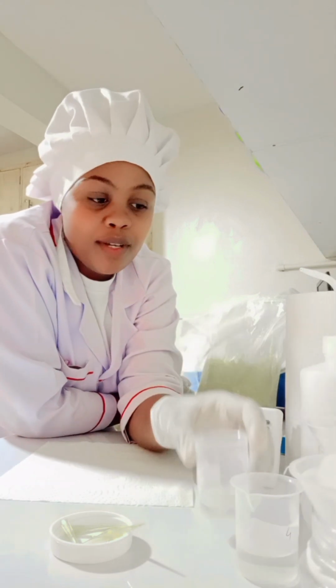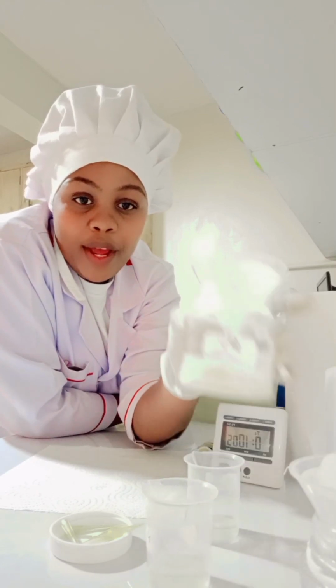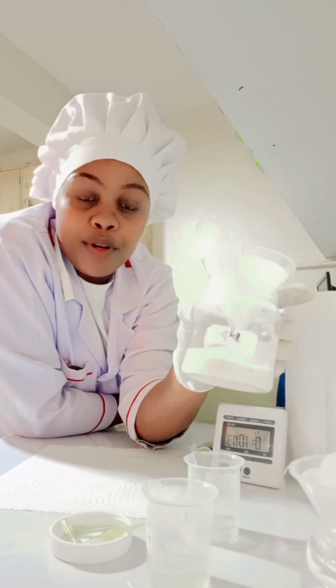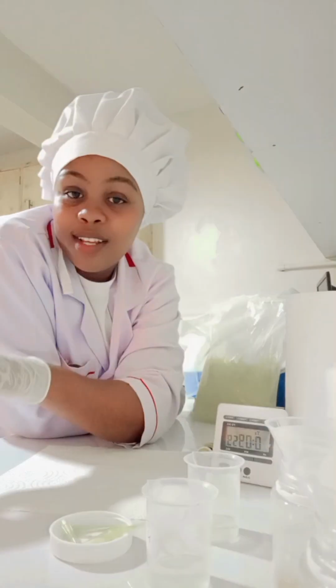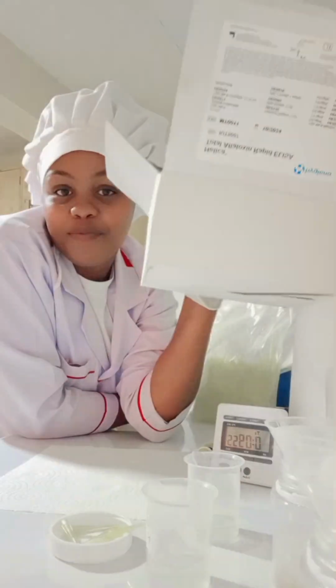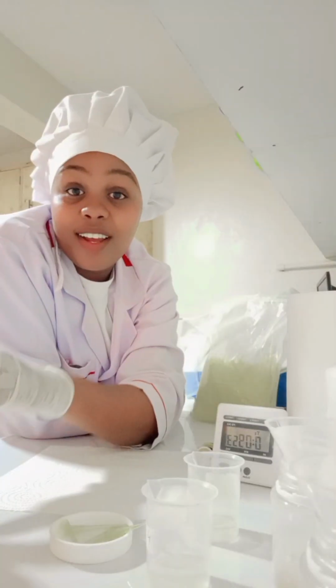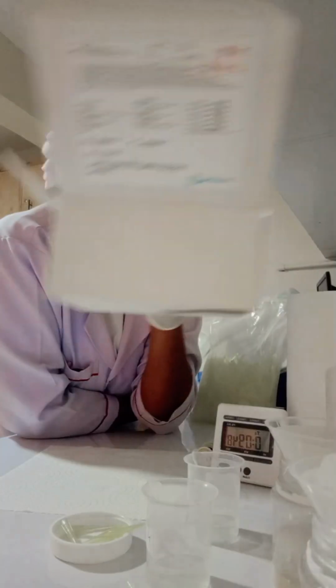I was showing you the beakers. Those are the mixing jars. That's where I mix. I do the sample preparation. Actually, I'm doing a voiceover of exactly what I was saying. This is the kit. It's an aflatoxin kit. It's everything. The way you see how small it is, it's everything.